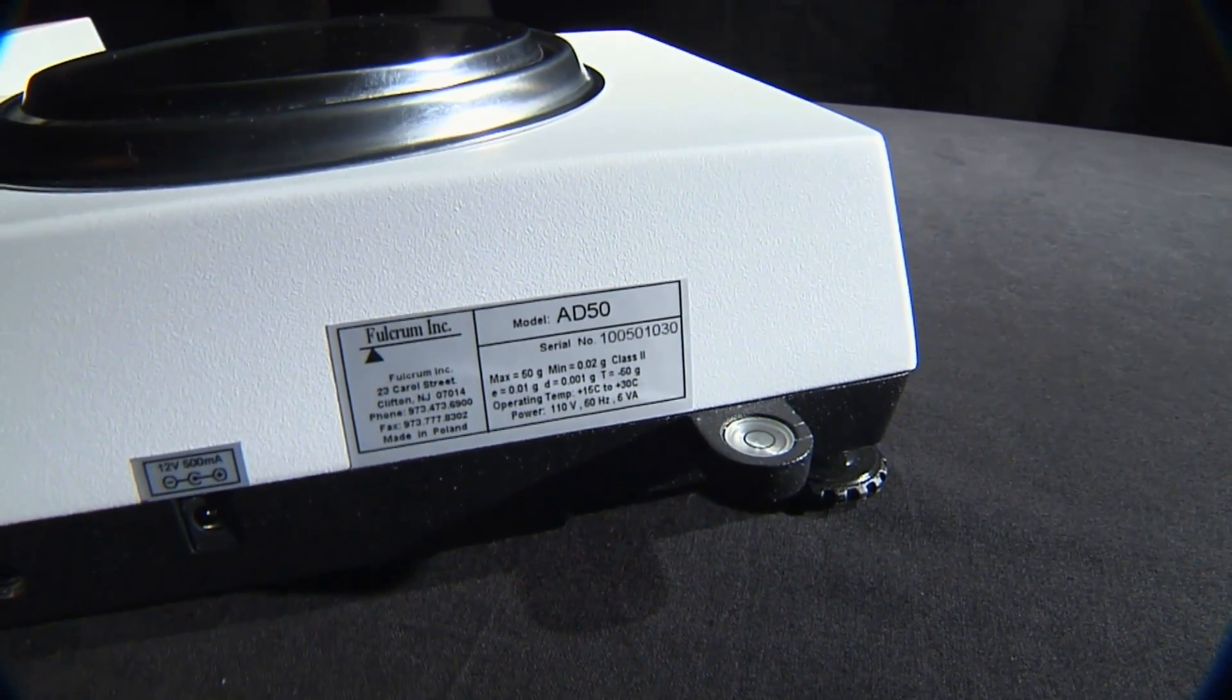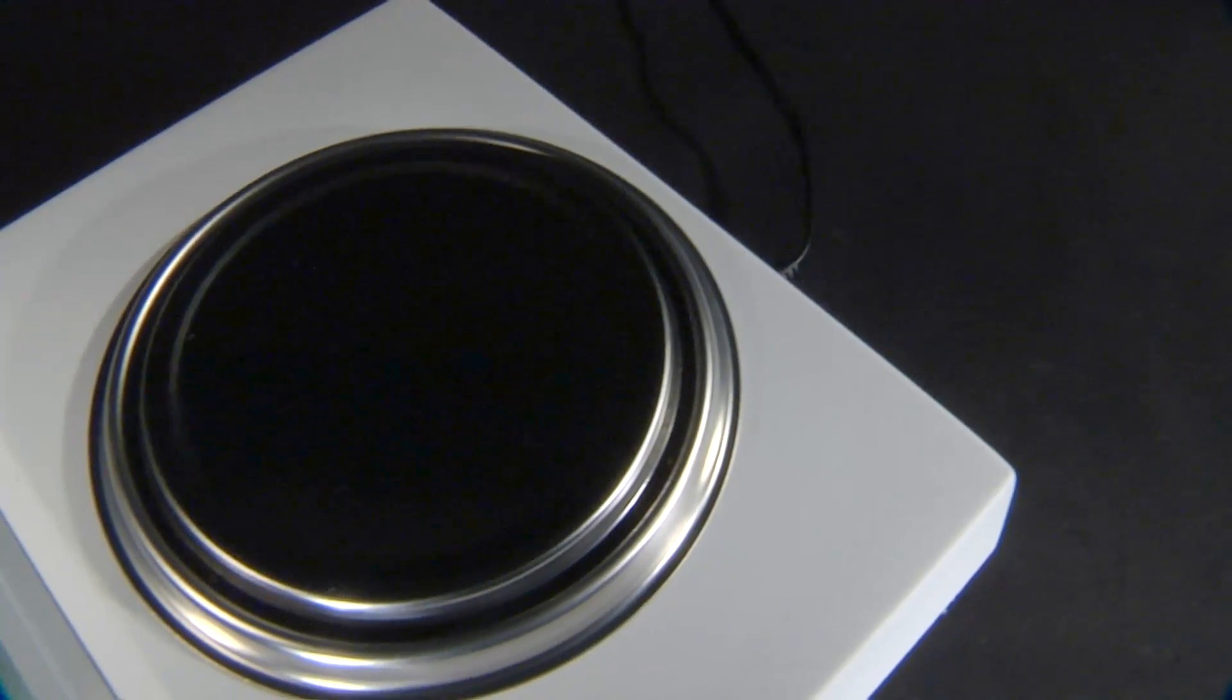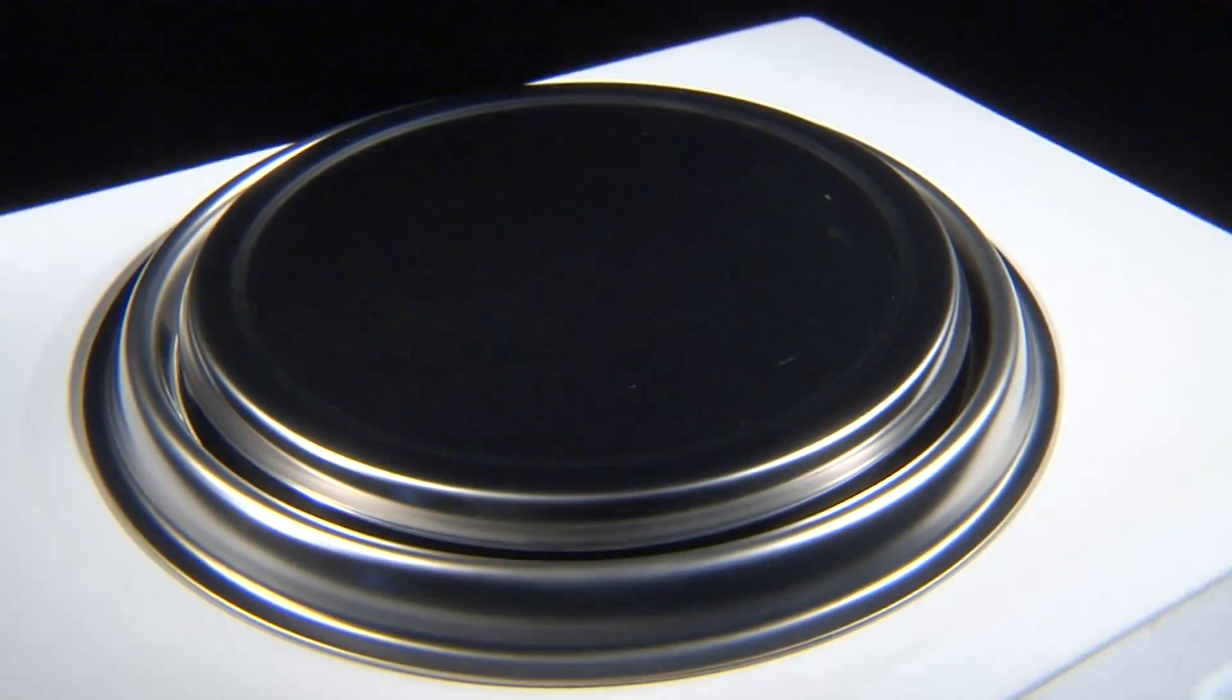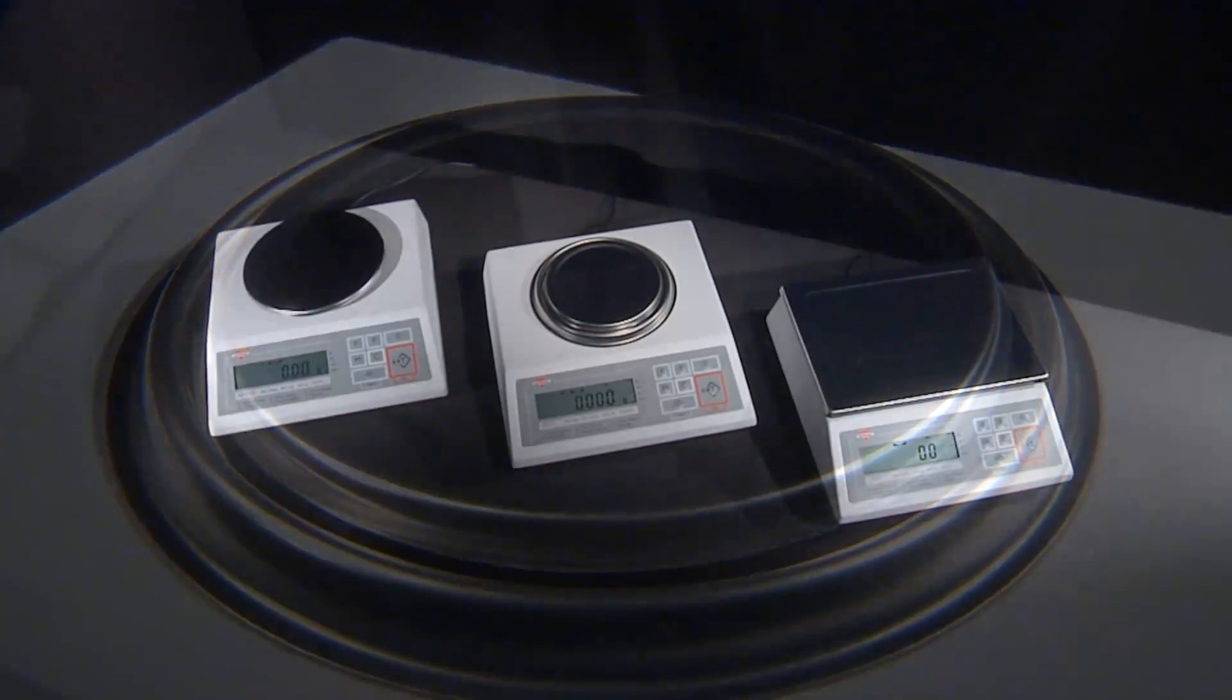The AD also is furnished with a stainless steel pan that is resistant to chemicals and possible staining. Depending on the capacity of the scale, the pan is furnished in three different sizes.